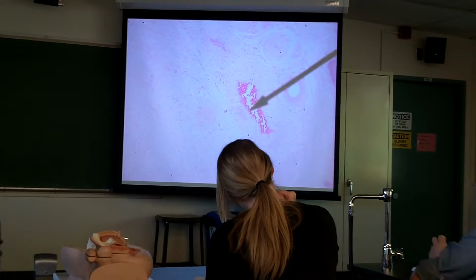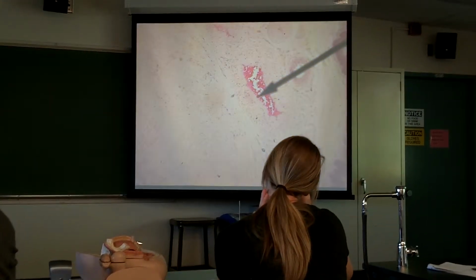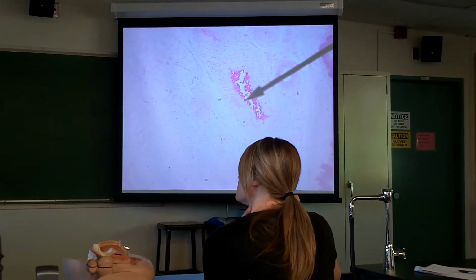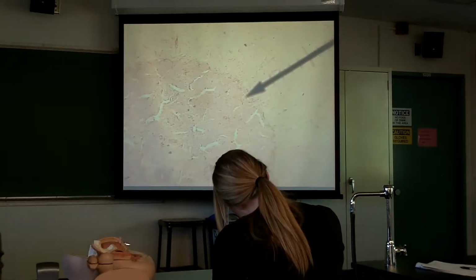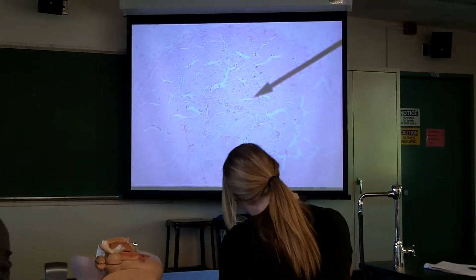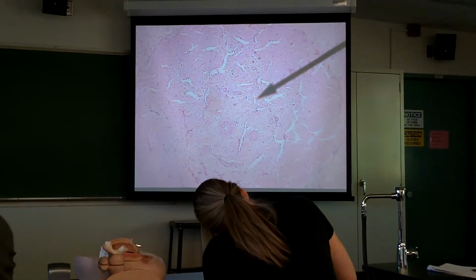So if you see blood vessels, but you see no vas in sight, you can assume that you're looking at the penis, not the spermatic cord. So those will be dorsal blood vessels. And the erectile tissue up here, look at all those chambers that would fill with blood. That erectile tissue is the corpora cavernosa. But there's only one chamber because this is a monkey penis.